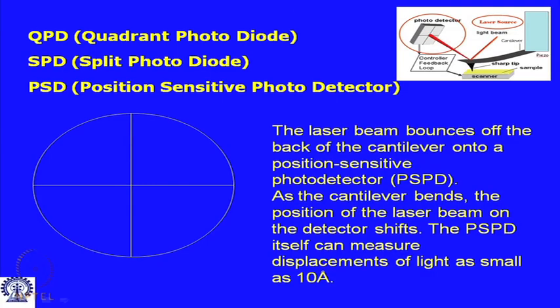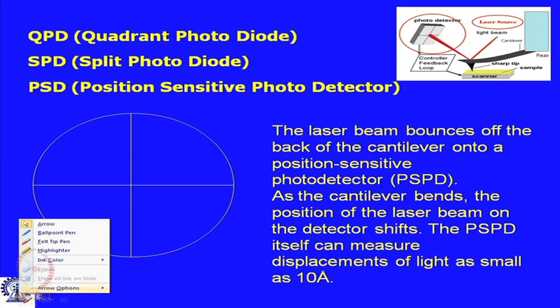If you look at this particular figure towards the right side of the screen, it probably makes much more sense to you right now. You understand that there is a piezoelectric element, which is the scanner essentially. We will discuss a little bit more on the scanner today. You understand the sharp cantilever and its role, and the sharp tip which is used for actually probing the surface.